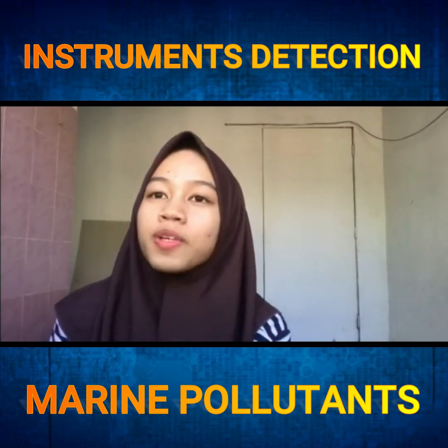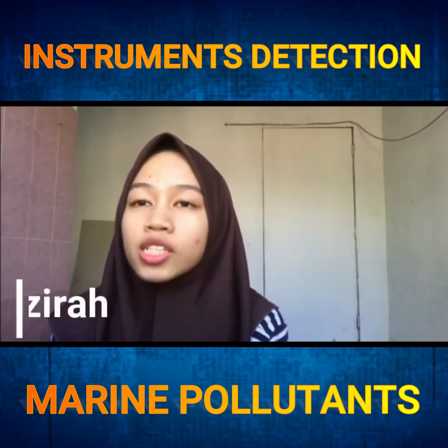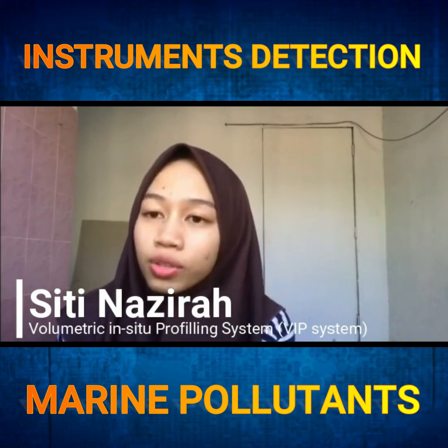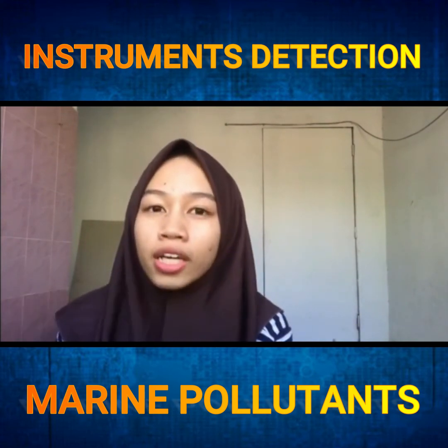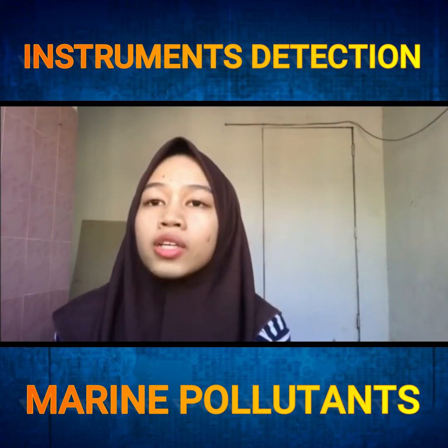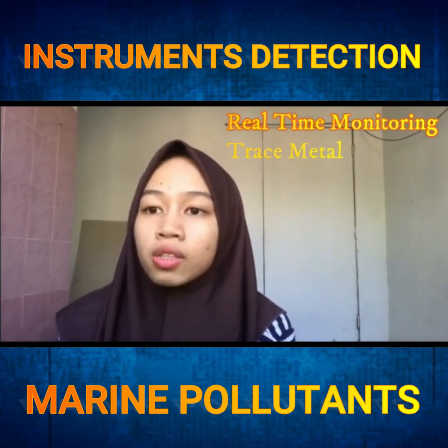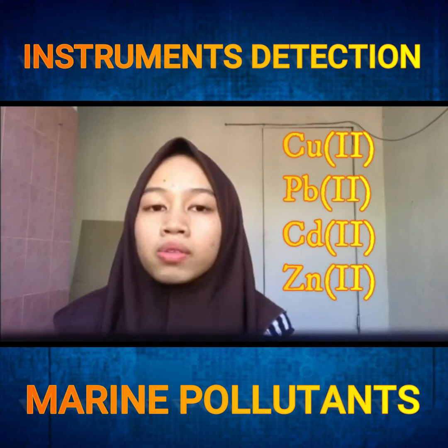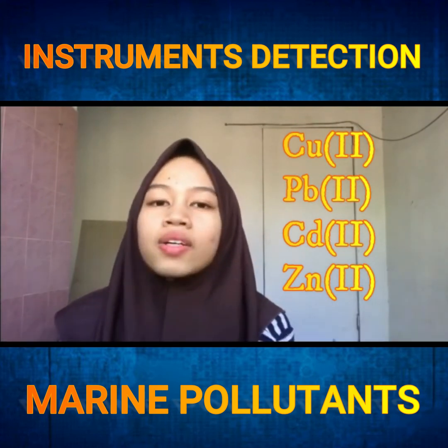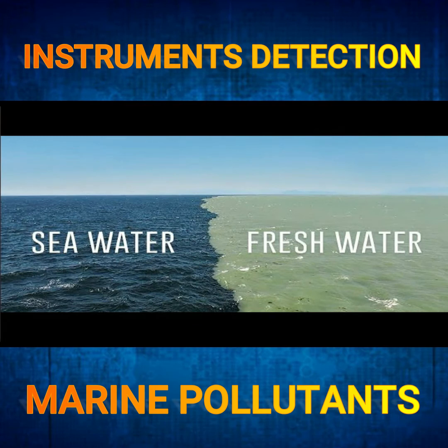Hi, Assalamualaikum. Okay, let's move to the next instrument, which is the voltammetric in situ profiling system, or known as the VIP system. Okay, you can look at the picture given there. This is the VIP system. This VIP system is for continuous real-time monitoring of trace metals such as copper, lead, cadmium, and zinc. This VIP system can be used in both fresh and seawater.